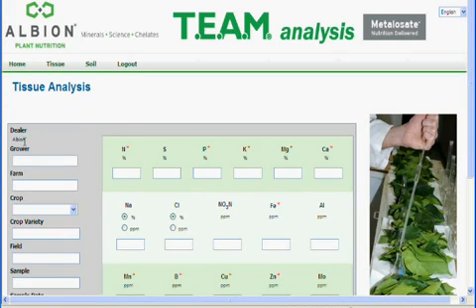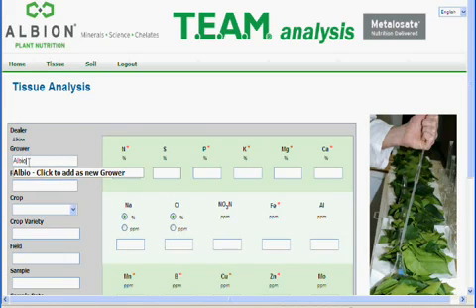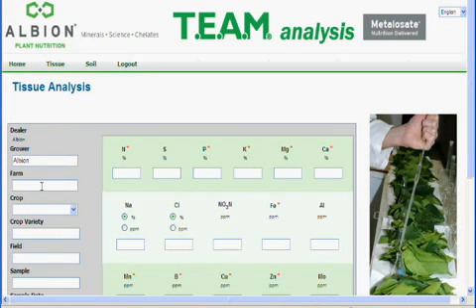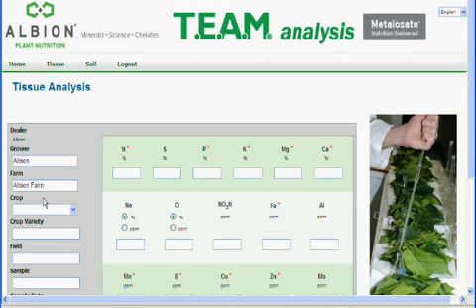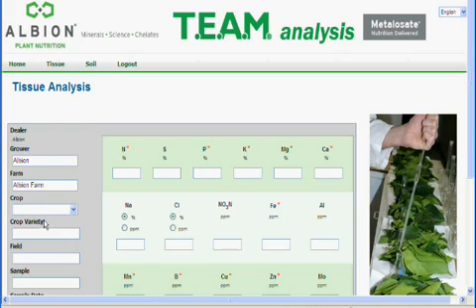Next, enter the grower, farm, and the crop for the sample you will be entering. When entering both the grower and farm information, the first time you will need to input the complete name and then select as grower, like this, and click on Add as new grower. The next time you need to enter the same grower, just type in the first two characters of the name and the form will remember the grower and the farms for ease of use. These first three fields are the only required fields in this list on the left.